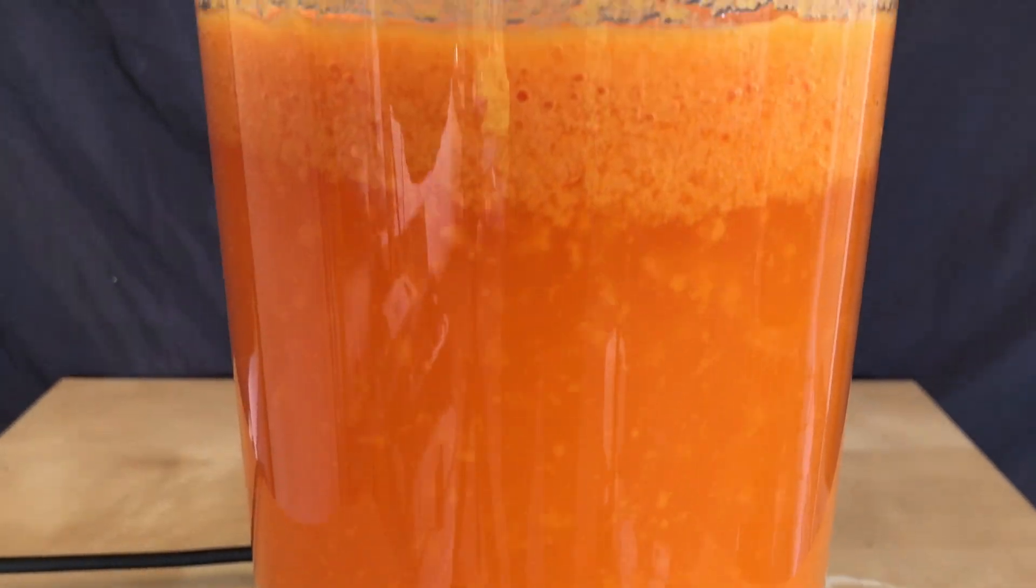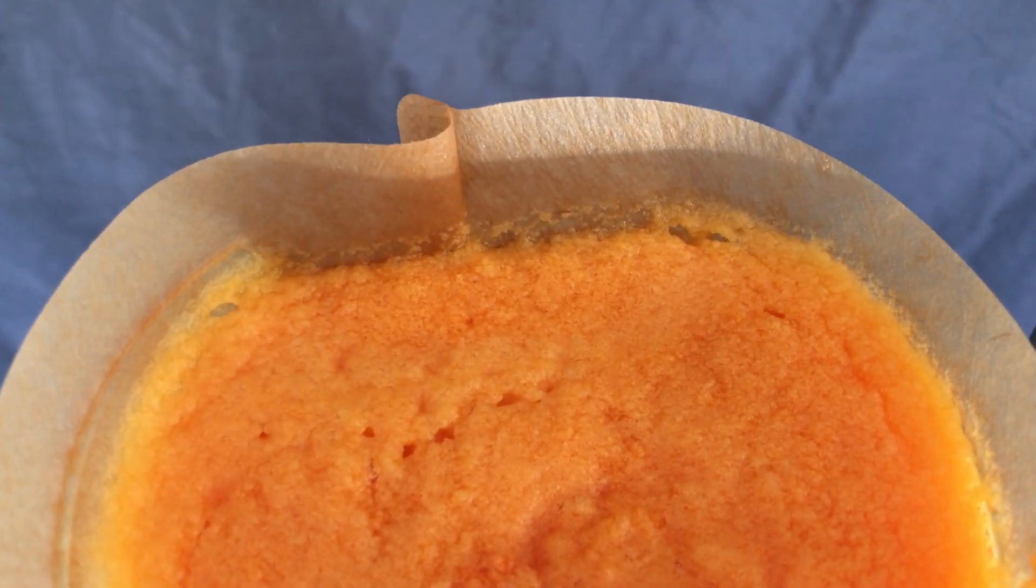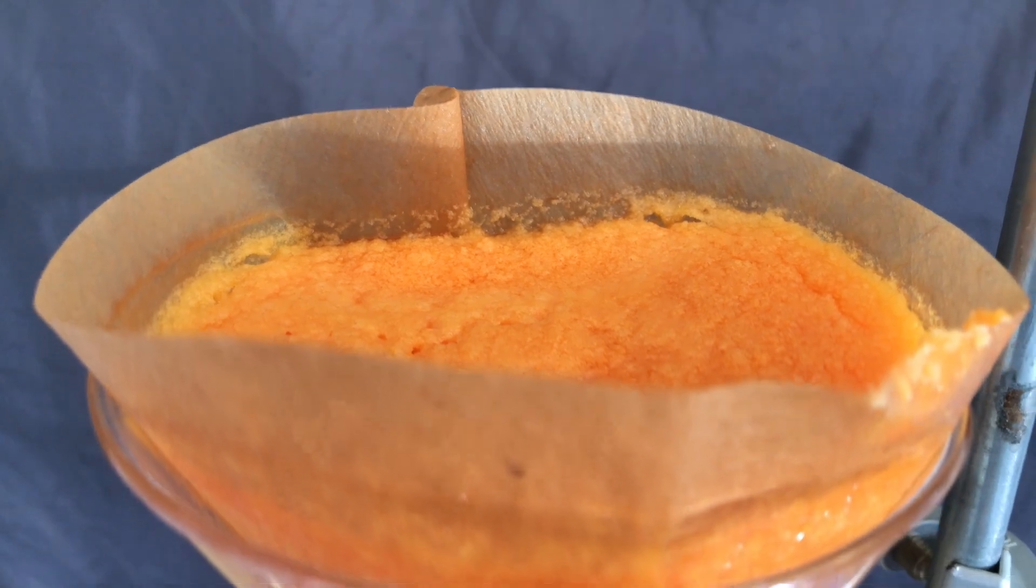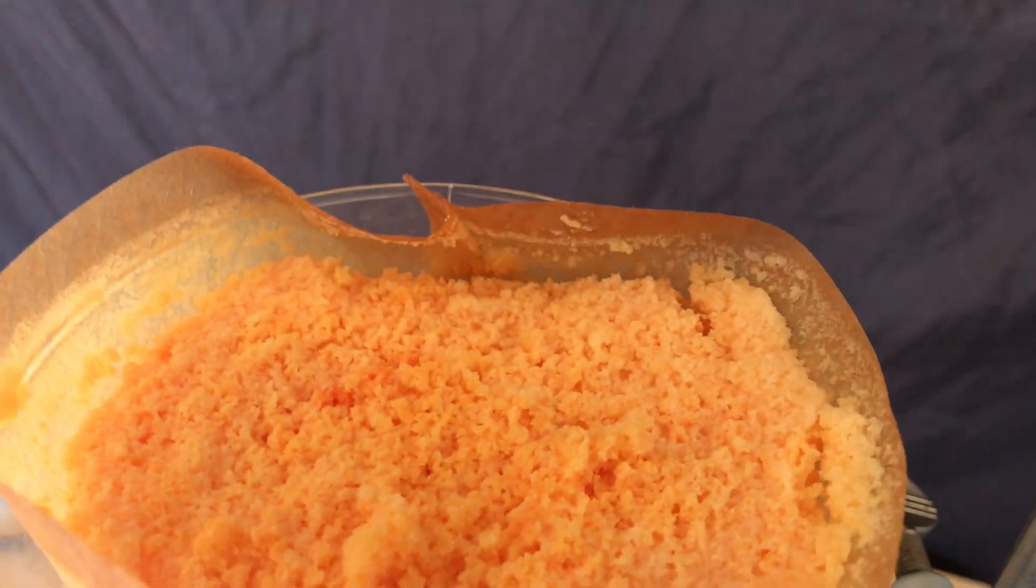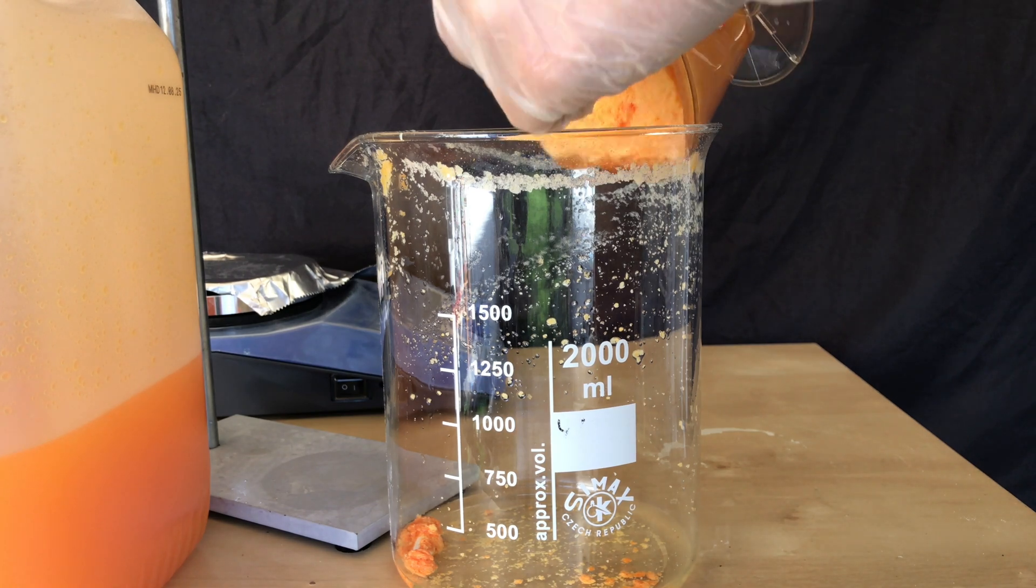Once the acid was added it immediately crashed out and formed these flakes. Everything also turned slightly orange because leftover bromate released bromine. After the gravity filtration I also washed the product using 100 milliliters of distilled water.